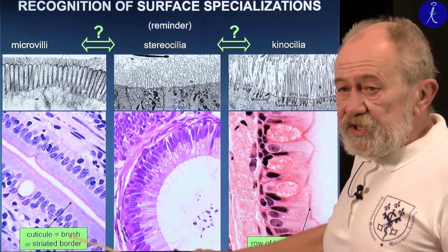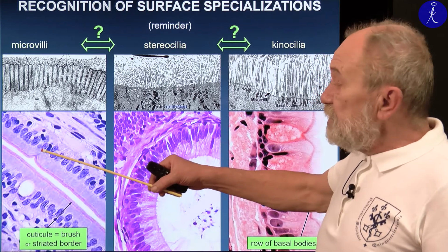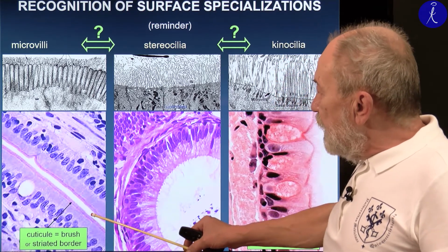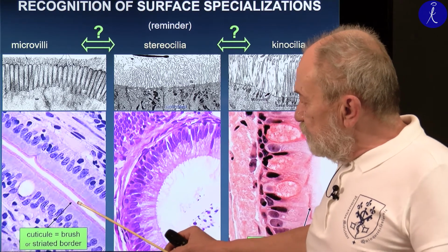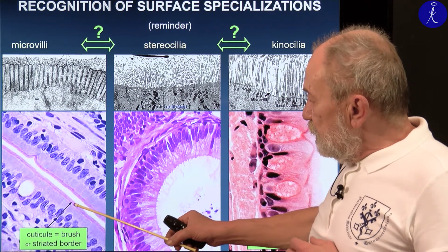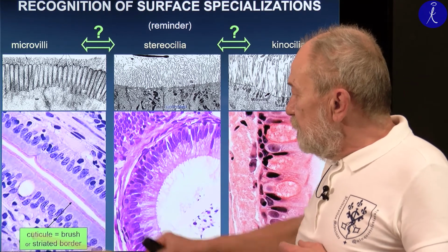And the real histological slide, this is the thing you see on the exam, before you saw it during the semester. This is the beautiful row of microvilli. This one appears as brush border, or because the individual microvillus cannot be resolved by the microscope, it looks like a striated border having cross striation in it.